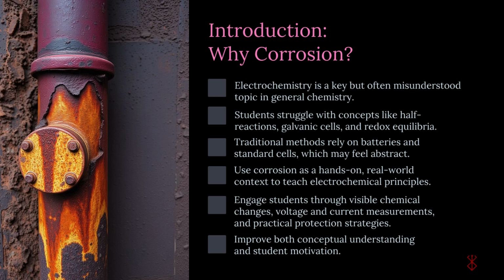The experiment is simple, inexpensive, and fits within a standard lab period. It uses everyday materials, like a digital multimeter and common metals, to simulate environments similar to those encountered in real military or maritime settings, such as fresh and salt water. In this presentation, we will explain the scientific background behind corrosion, describe the laboratory experiments in detail, and highlight the educational outcomes of the innovative teaching approach.